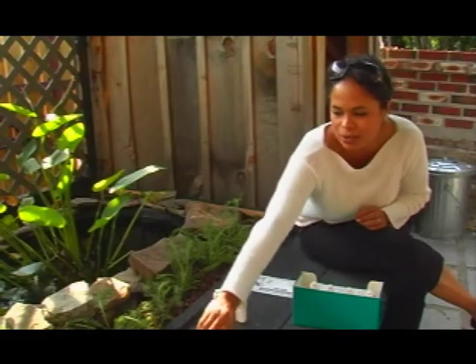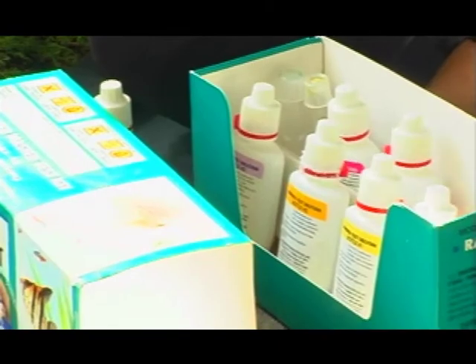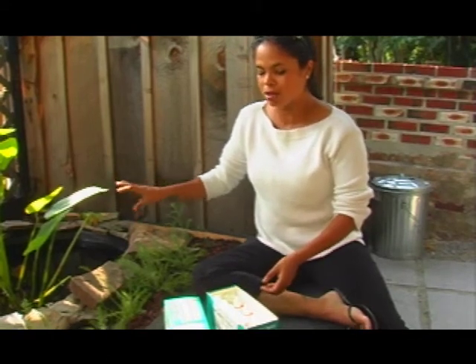I have here a freshwater test kit and it comes complete with a bunch of different tests. Right now I don't have any fish in here, so what I want to do is I want to test just the pH to see whether it's more alkaline or more acidic.